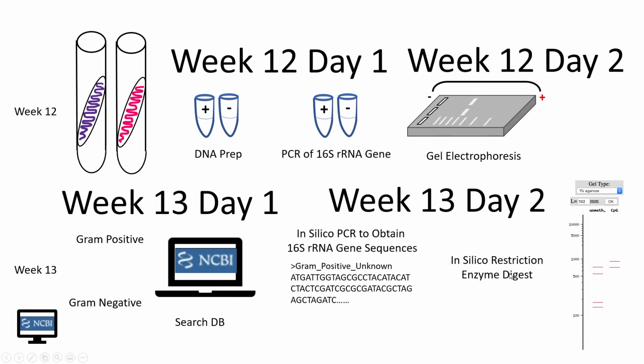We'll come in, we will load up our information on the computers, and then we will run a gel, and the gel kind of guesses. It's not so much a guess, but it does guess to an extent the restriction digest, and it figures out where the bands will appear based off of our organism. And that will cover the whole unknown project. Now, the last day, which is the next week, you'll be turning in your unknown report, which we'll talk more about later.